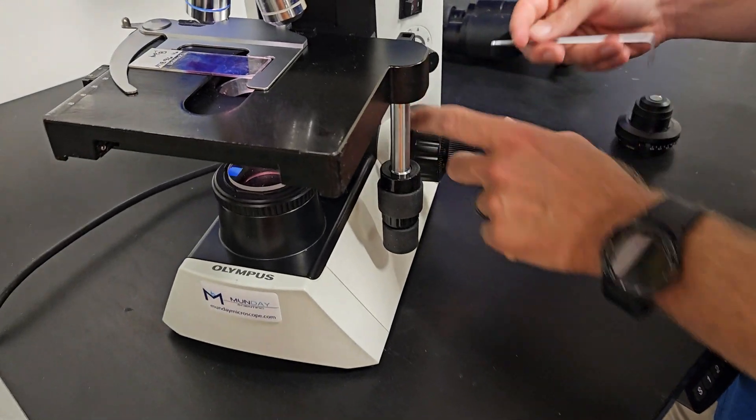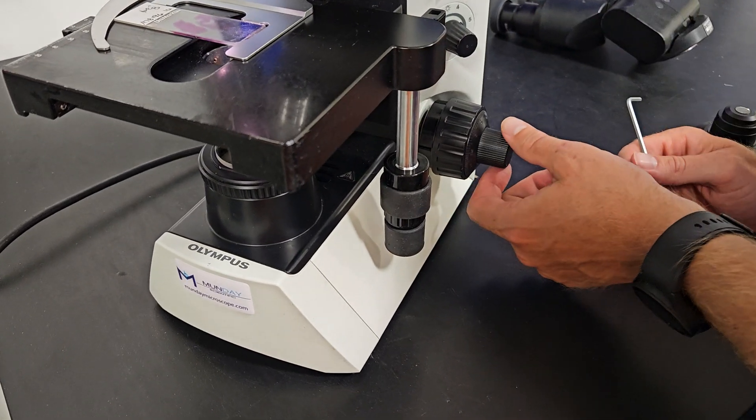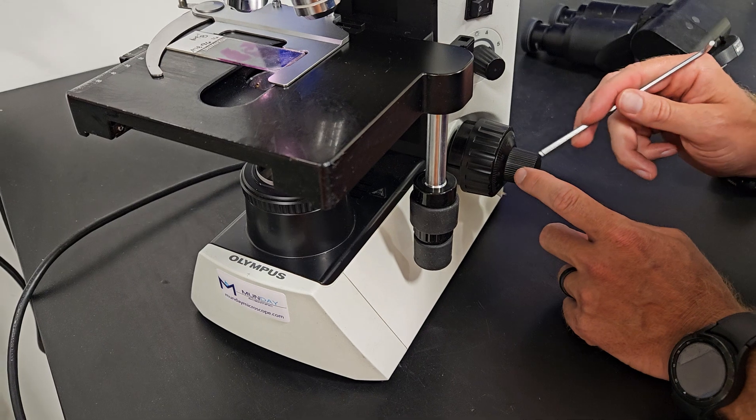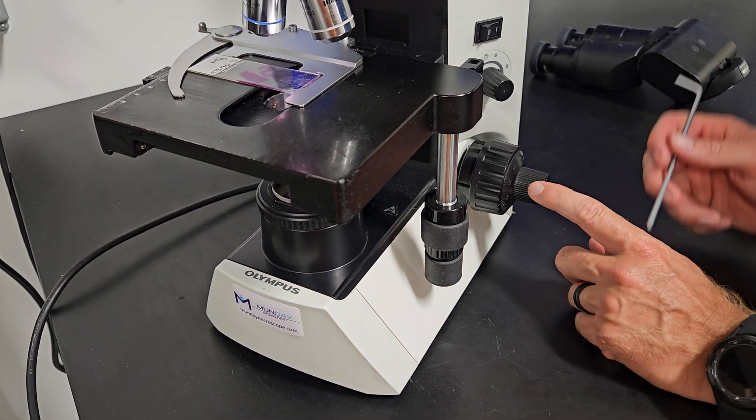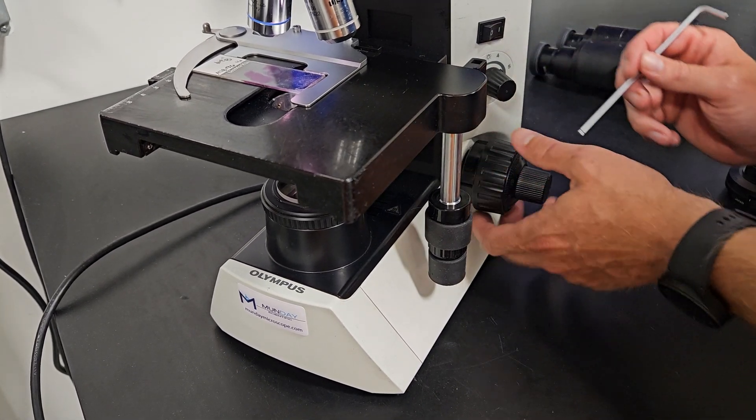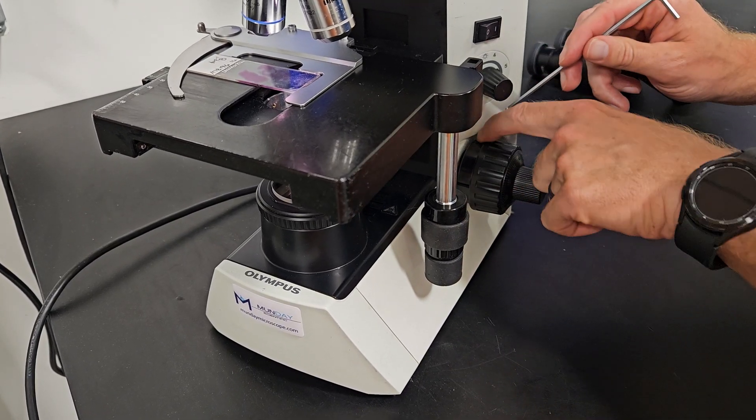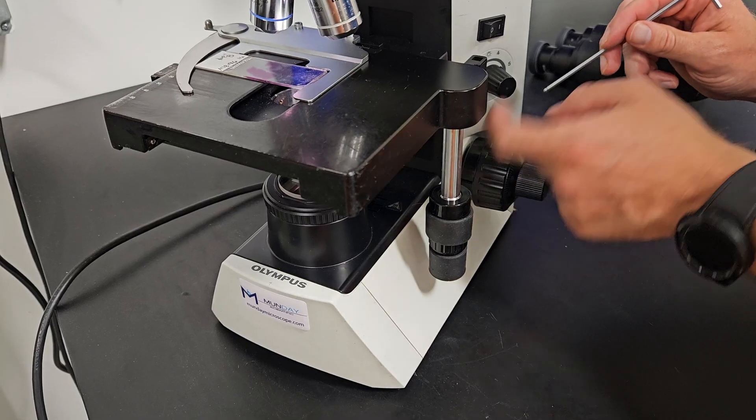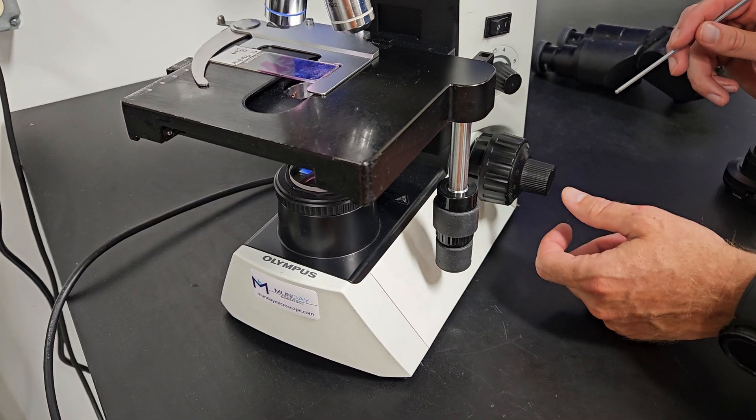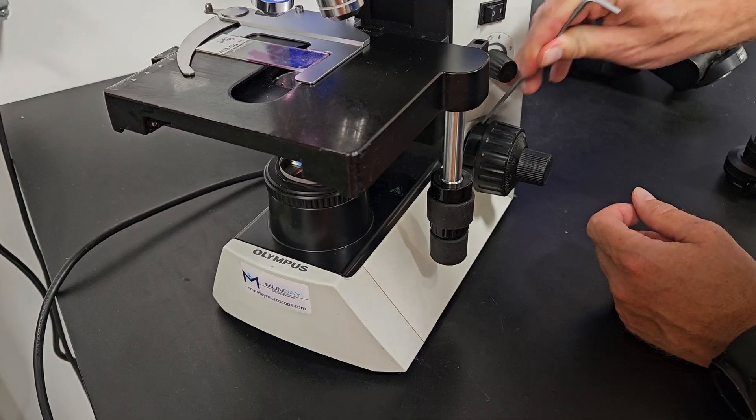Right here is your tension ring. If you ever notice the microscope moving, this fine focus knob moving without you touching it, it's likely that the tension has been accidentally backed off. You just put a flathead screwdriver or a wrench in this notch right here and turn it towards the wall and it'll correct that issue.